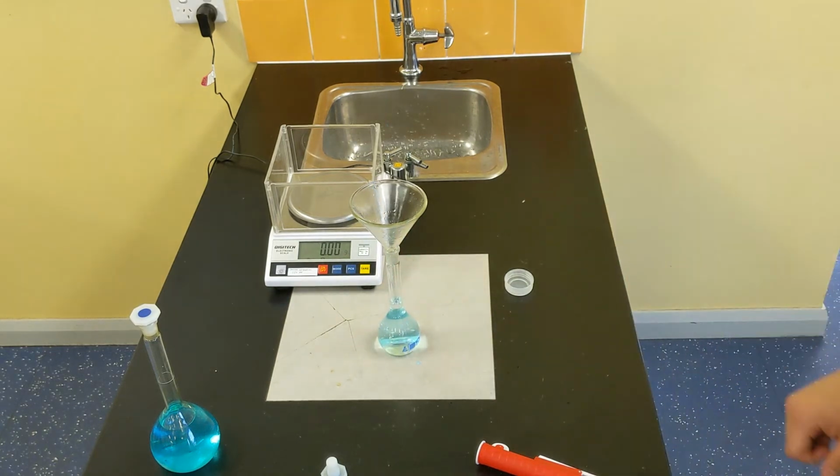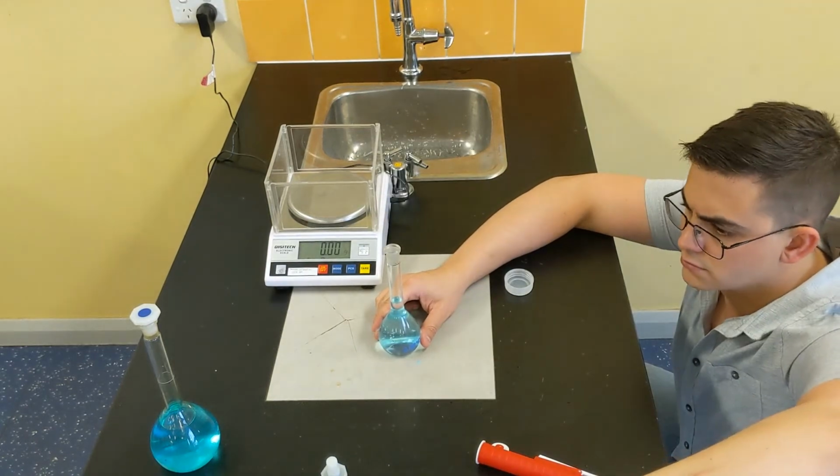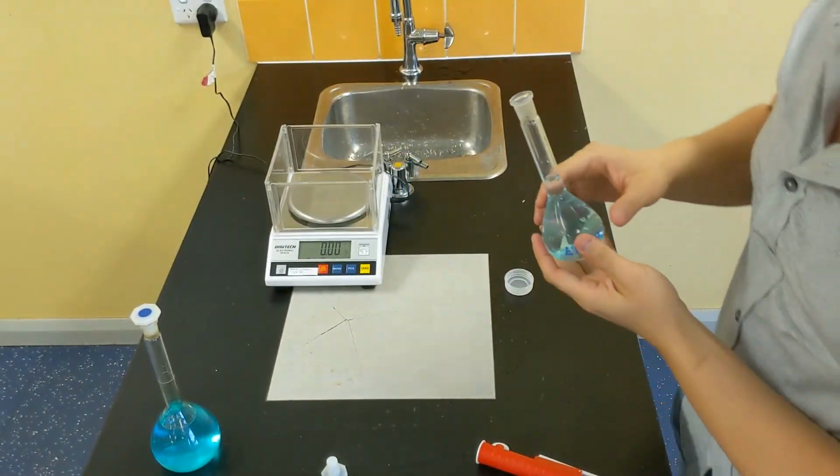I'm then going to add slowly with a beaker. It gives me a little bit more controlled pouring. Or actually, I'm not even going to be using a beaker. I must be pretty close to the mark. Trying to show you. Obviously, it didn't work so well.